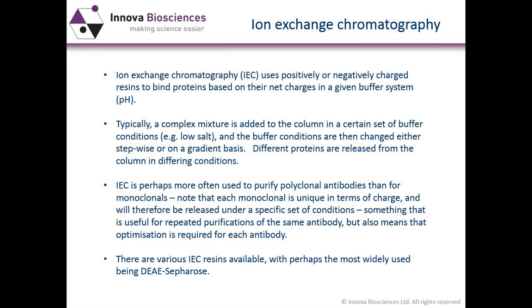The next technique I'd like to talk about briefly is ion exchange chromatography. Ion exchange chromatography uses a positively or negatively charged resin to bind proteins based on their net charges in a given buffer system.